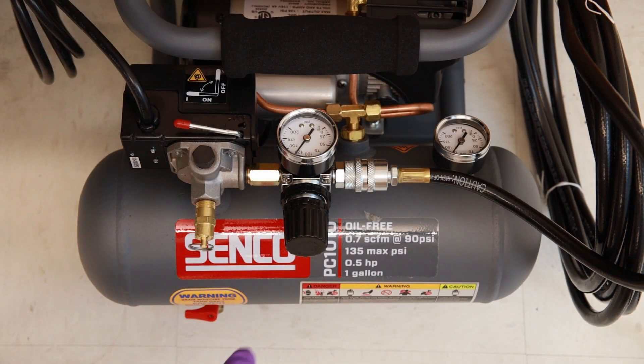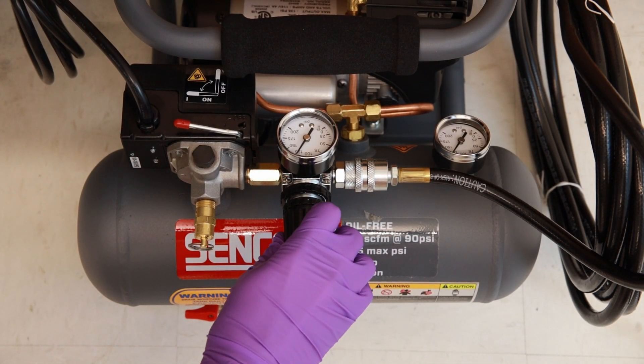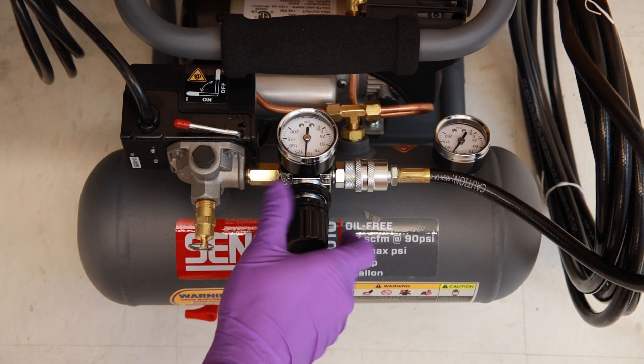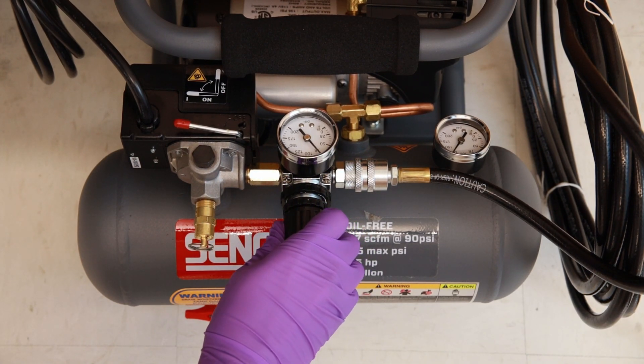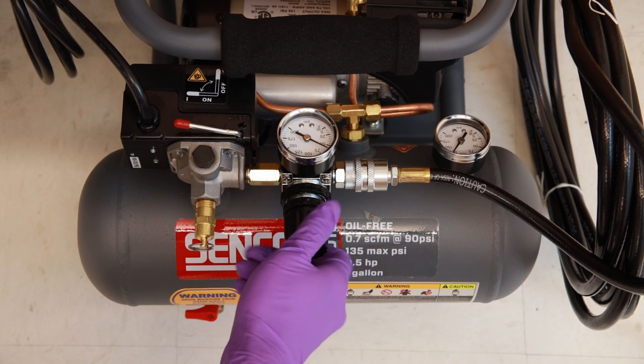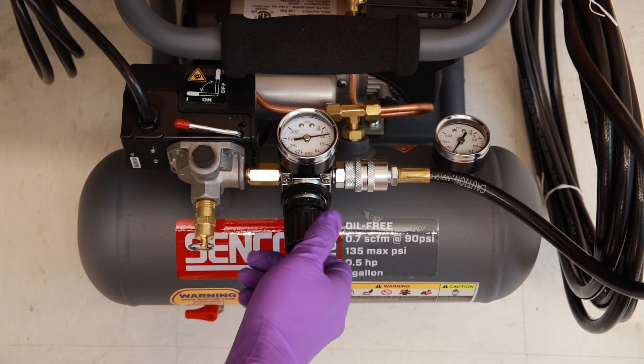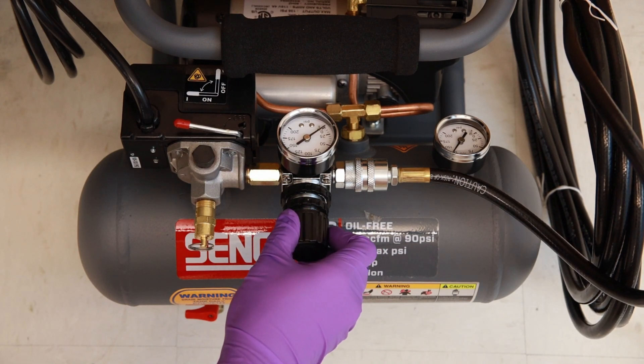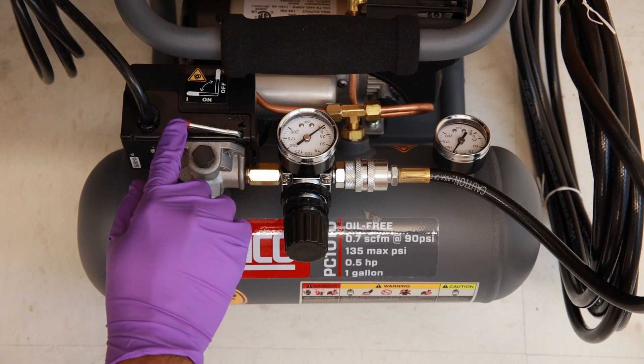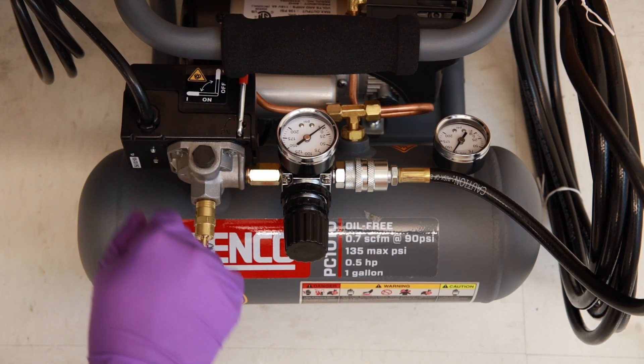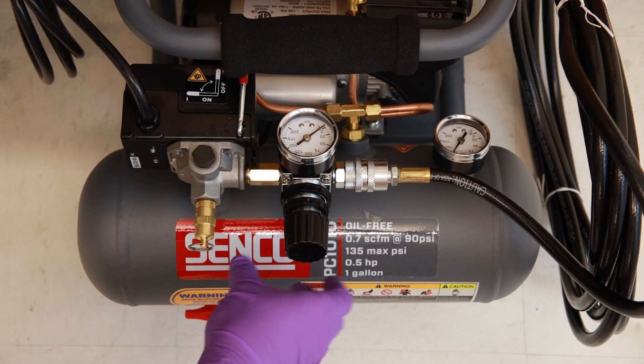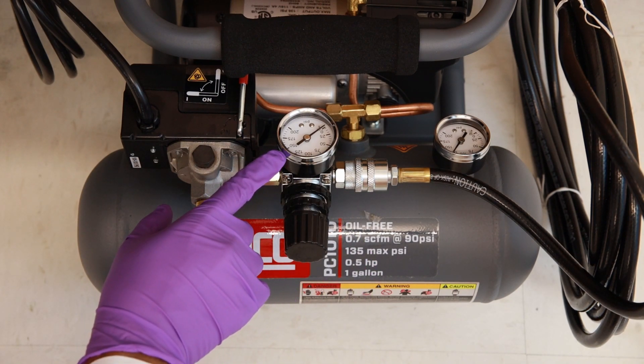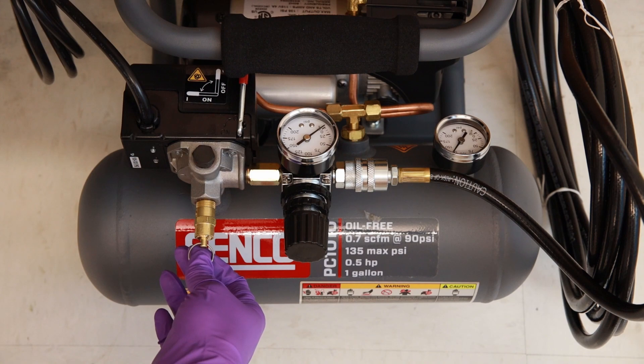Turn the knob on the air compressor counterclockwise to release the pressure. Once the pressure gauge reads zero, turn the lever position from on to off. Once the pressure gauge reads zero, pull the release valve. Be cautious as you will hear a loud hiss noise.